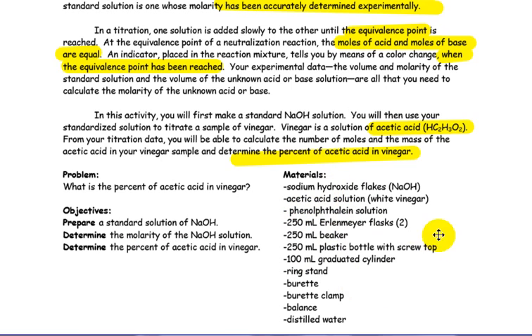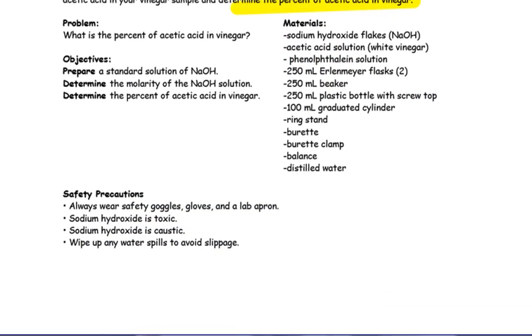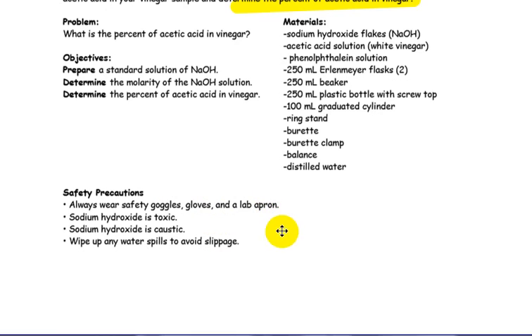Materials are included here, and of course safety goggles, etc. Sodium hydroxide is toxic, caustic. Wipe up any spills to avoid slippage, and let me know if something gets spilled.